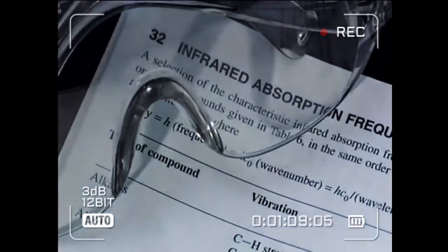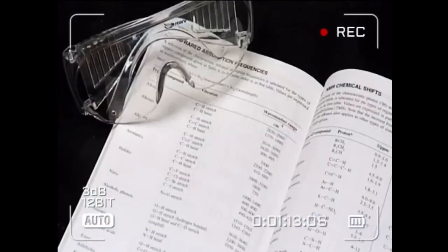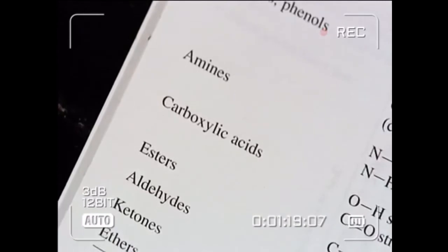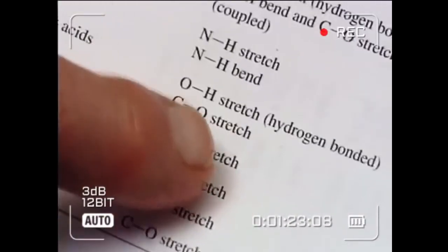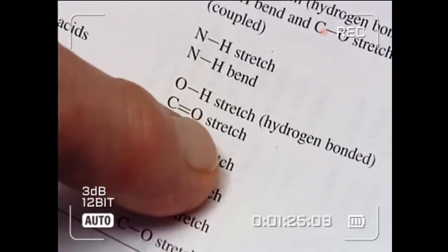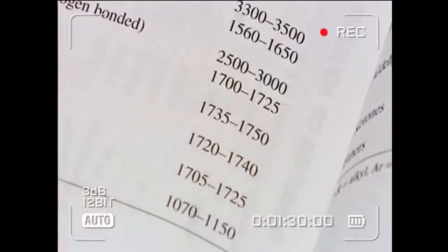Each bond, such as O-H, C=O, N-H and so on, absorbs at a particular frequency. This allows it to be identified. For historical reasons, and because the numbers are easy to work with, chemists dealing with IR spectra use a unit called wave numbers.